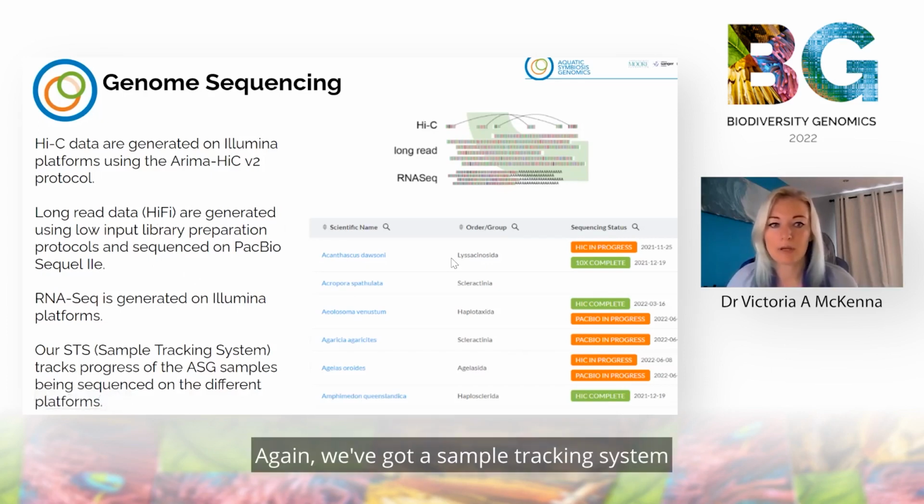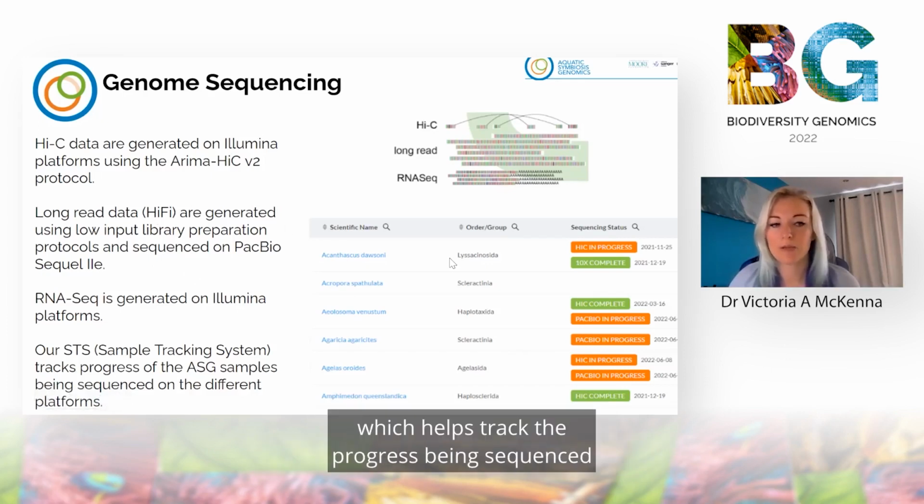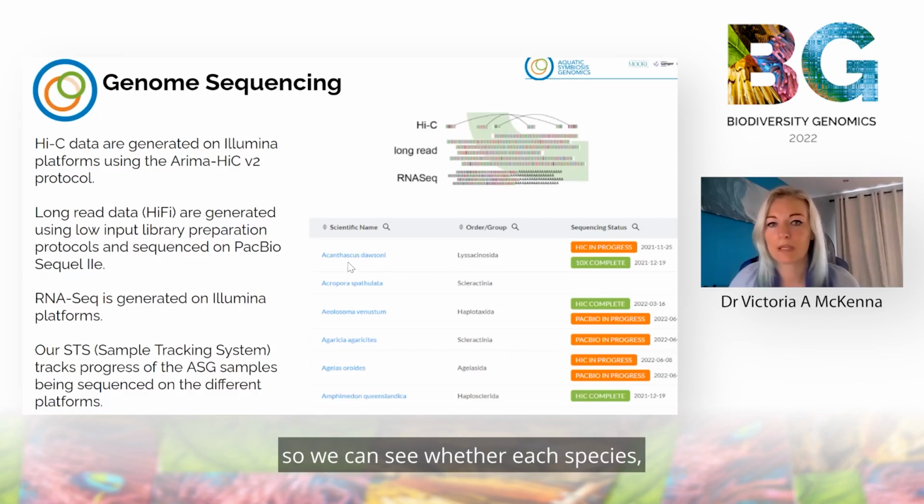Again, we've got a sample tracking system which helps track the progress of sequencing on the different platforms. So we can see whether, for each species, the Hi-C is in progress, for example, or whether the PacBio is complete.